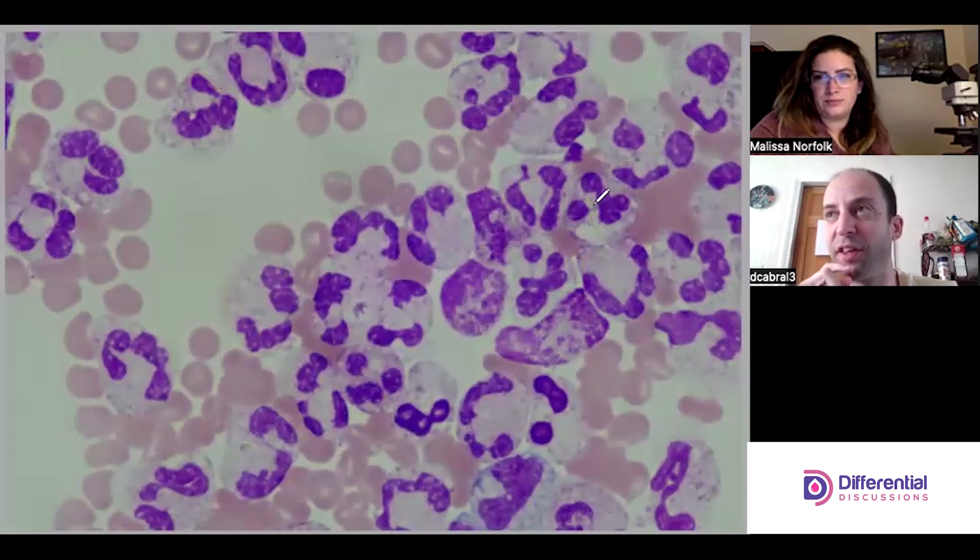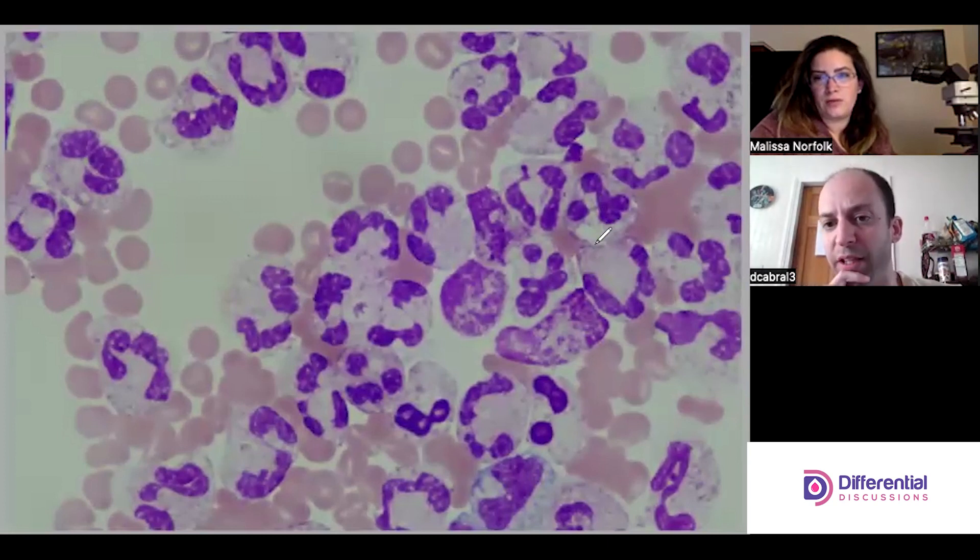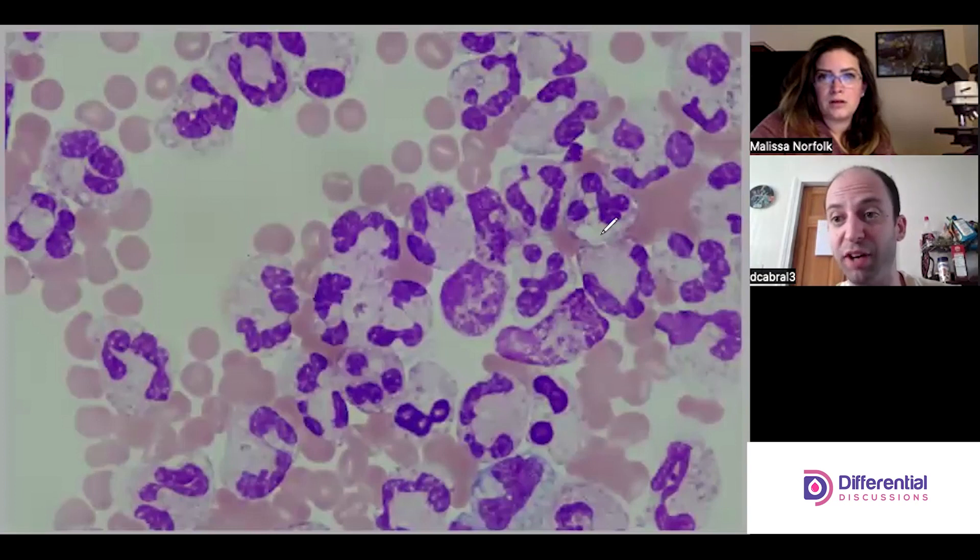Whenever there is a negative space — it could be between cells — internally is kind of the gold standard. When the crystal is inside of a white cell it's pretty definitive. But if you have a negative space that has refractivity to it, it is 100 percent a crystal.